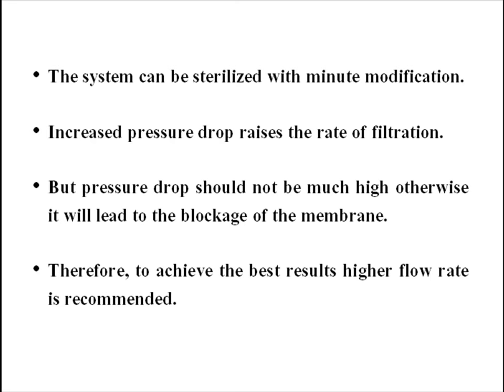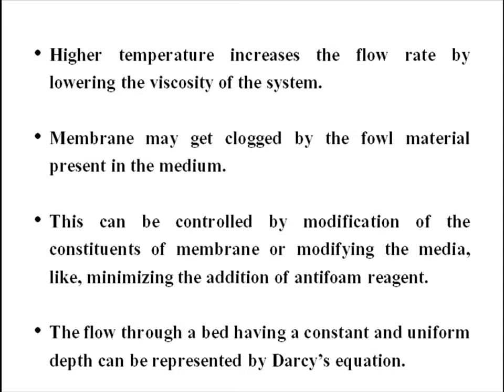Increased pressure drop raises the rate of filtration, but the pressure drop should not be too high, otherwise it will lead to blockage of the membrane. Therefore, to achieve the best results, a higher flow rate is recommended. Higher temperature increases the flow rate by lowering the viscosity of the system. Membrane may get clogged by the foul material present in the medium. This can be controlled by modification of the constituents of the membrane or modifying the media, like minimizing the addition of antifoam reagent. The flow through a bed having a constant and uniform depth can be represented by Darcy's equation.